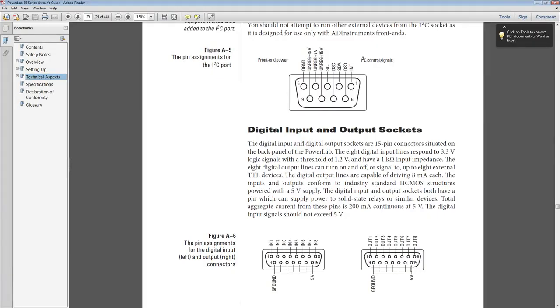The digital outputs are ways for LabChart and the PowerLab to send TTL pulses or signals. It's just going to be a simple, almost a unit spike that will go out and can signal another device to say turn on, turn off, or perform some task. It's just a really simple signal. There's no waveform to it or anything like that. It's just a really simple small pulse.